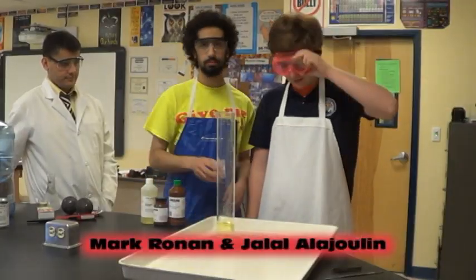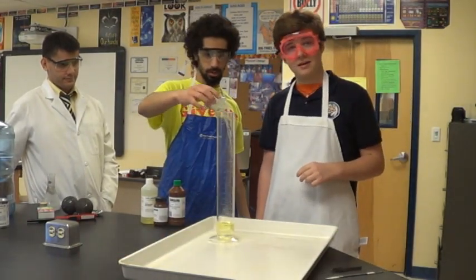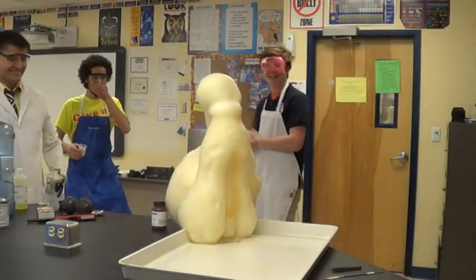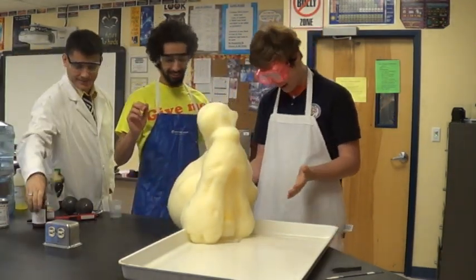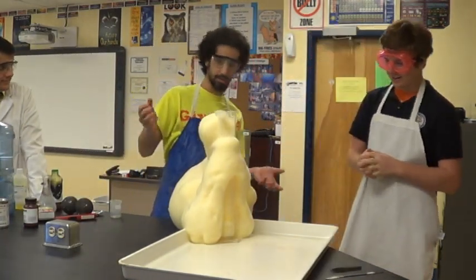First step: goggles. Check. Second step: experiment! Catalyst. Wait, you didn't move it! Oh my god! As you can see, this is an exothermic reaction, and it's emitting heat right now. As you can see, it's shrinking right now because of how much air it is.